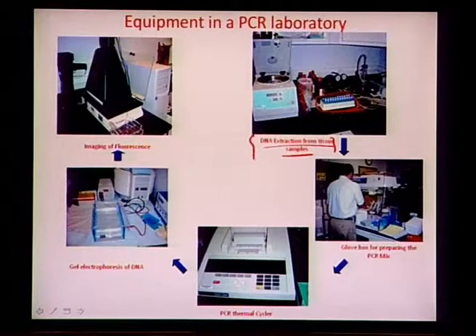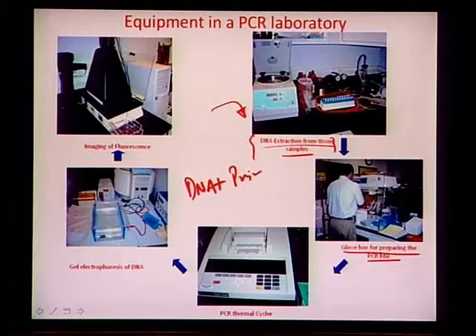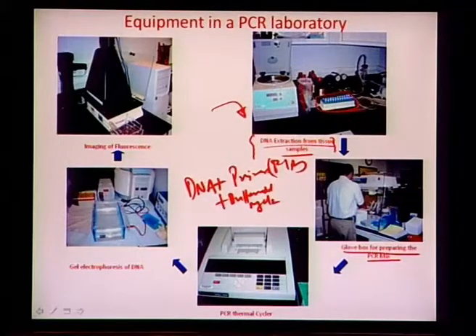So, this was a method developed in normal PCR laboratories for extracting pure DNA from the lipid layers and other non-participating junk in the cells apart from the DNA. Once the DNA is extracted, you have to prepare the PCR mix, including DNA, the primers, both forward and reverse, and the buffer solution, typically an MgCl2 kind of solution which keeps a certain pH level.